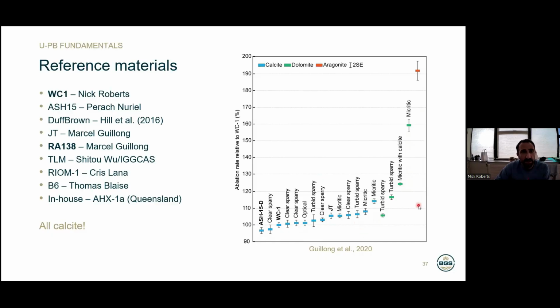The problem is, without dolomite standards, it's actually quite hard to prove what kind of inaccuracy we might have. At the moment, everyone is kind of hoping that it's within the uncertainties of our ages.